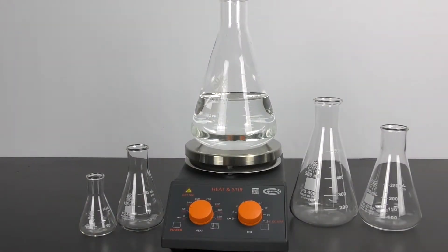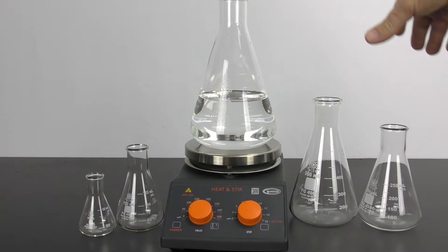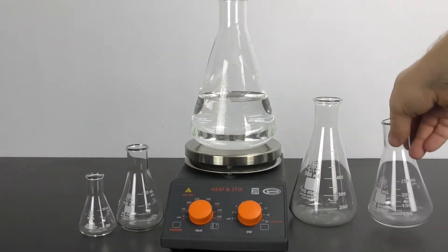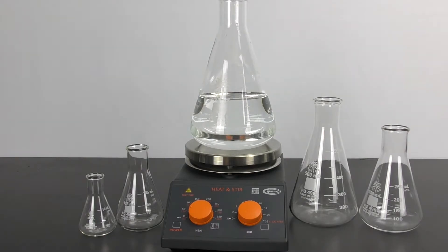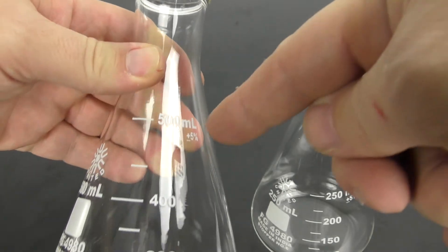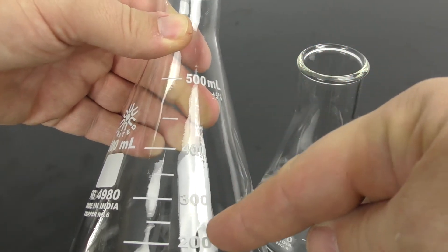Borosilicate glass is designed to give the best combination of thermal shock resistance, so you can put this on a hot plate very easily, as well as physical strength, so you can be confident it will not shatter. The rims are very heavy duty, and the graduations are durable and easy-to-read white enamel.